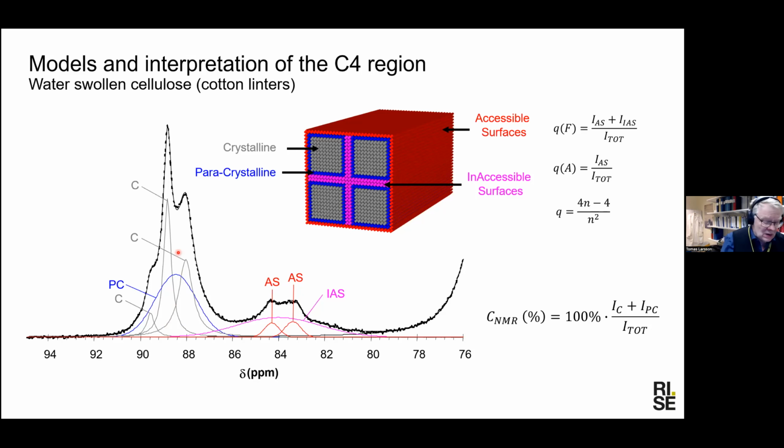And that means in our vocabulary that the polymers on surfaces have different conformations compared to the interior. But the interior is classified as a lattice of cellulose 1. It's a lattice type that has certain characteristics according to XRD. And that means that if a polymer doesn't have that conformation that is characteristic of the cellulose 1 lattice, then it's not a cellulose 1 lattice.